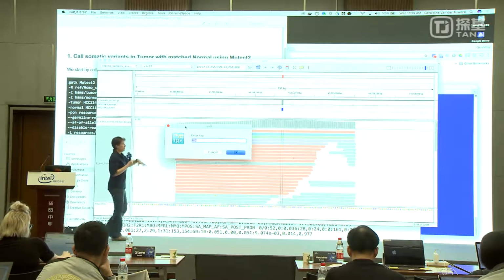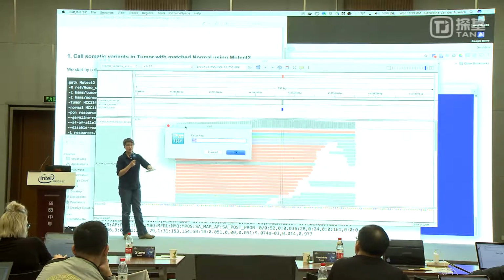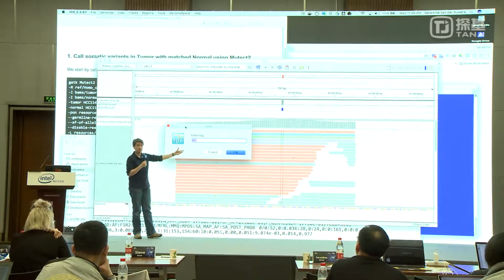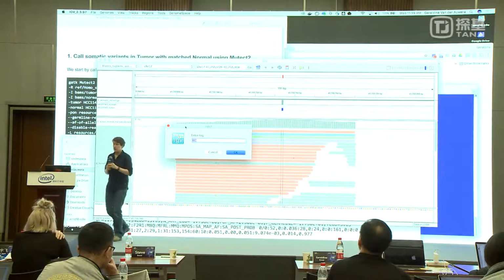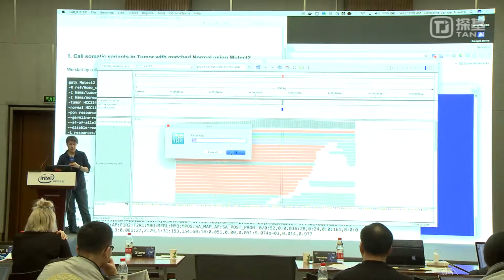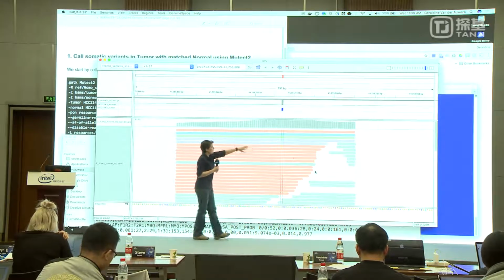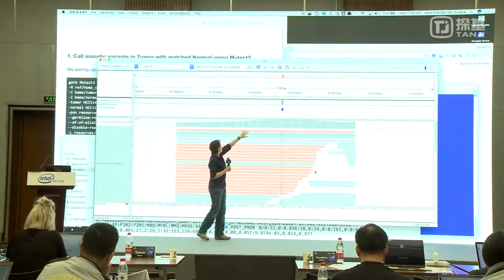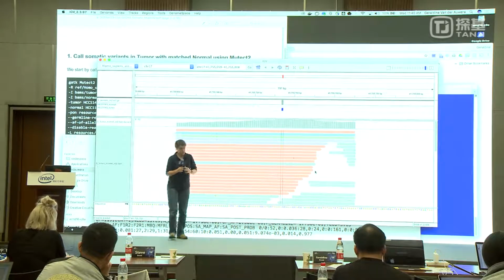And because I know this is Mutect2, we're not haplotype caller, but because it's using the same underlying machinery, and haplotype caller was first, that's why the tags that Mutect uses are named after haplotype caller. It's HC for haplotype caller, even if you're running with Mutect. And that's just because haplotype caller was made first. Okay. So this tells me that this set of reads were decided to support this, which is a reference haplotype that does not have any evidence of changes.